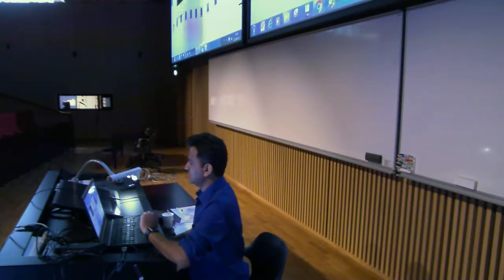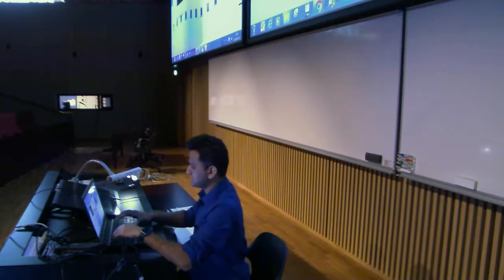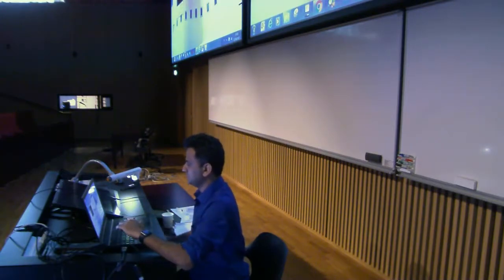And then all the time frames, but I'm only interested in, let's say, 45 to 51. And now it would just do this. You see here? Because there was only one Z slice, there is no point in having this Z. So it's just a single Z slice, but the time frames. So this is how you can change and crop the data accordingly.